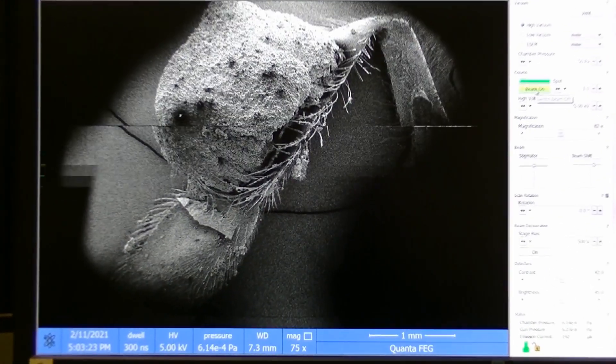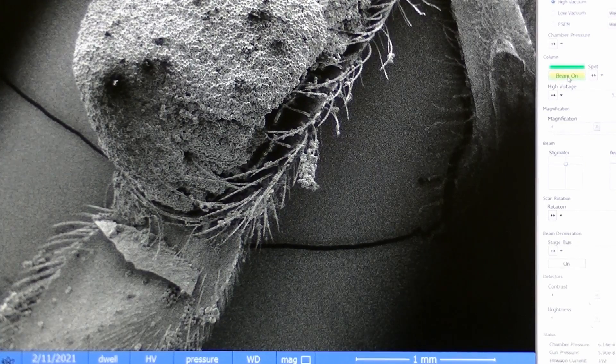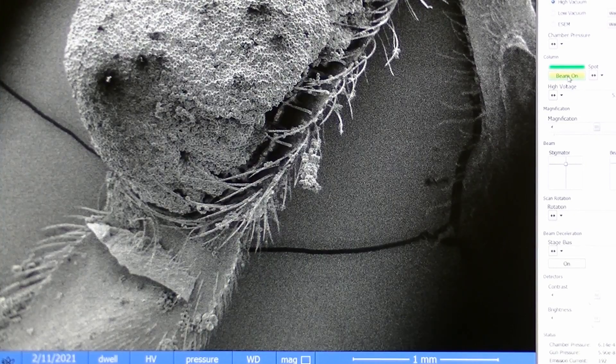We can adjust the magnification, the brightness and the contrast of the image and change the focus.